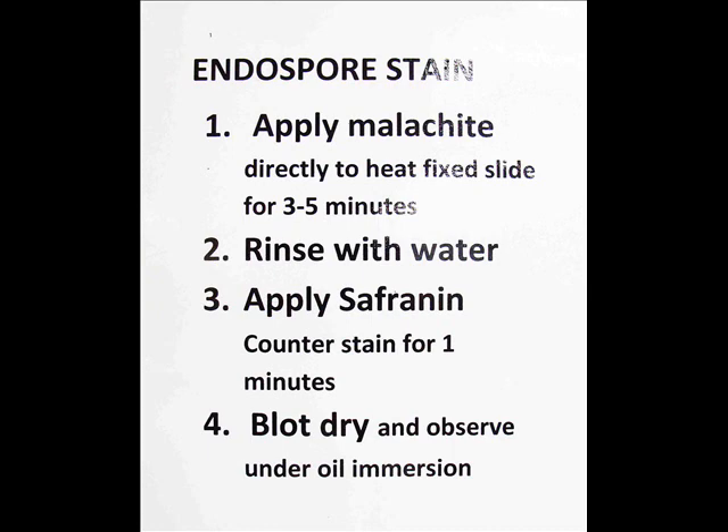Next we'll rinse the slide with water, and the final step is to apply the counter stain, safranin. This pink stain is a contrasting color to the green and will impart color to the vegetative bacterial cells.